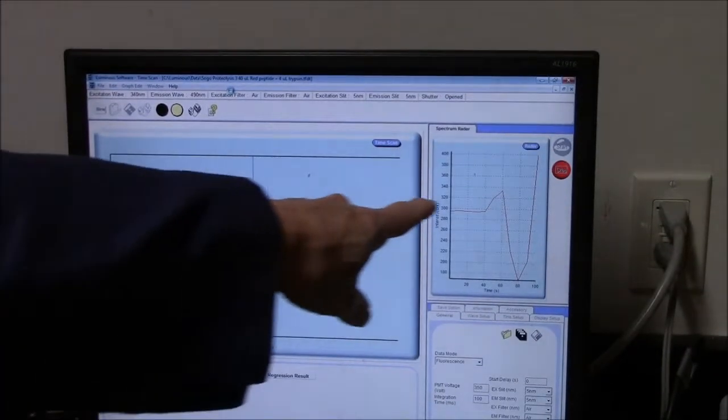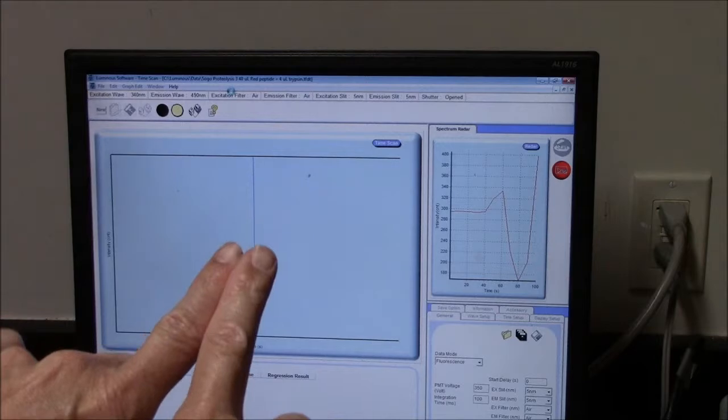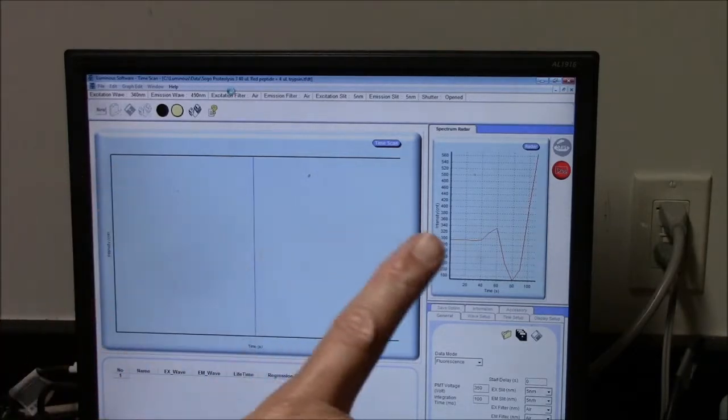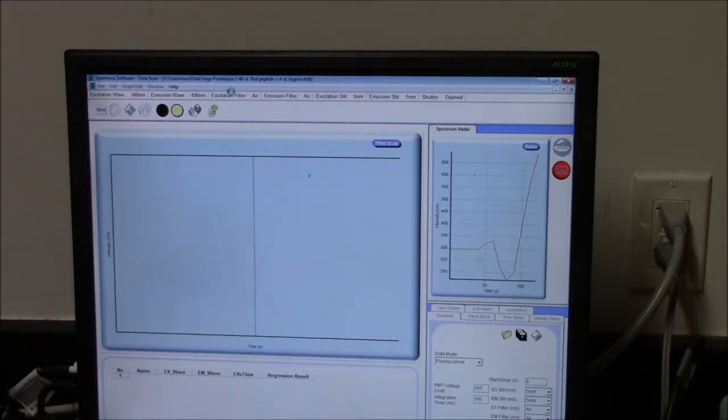So now I'm expecting to see the fluorescence start rising rapidly. As the peptide gets cut into 2 pieces, we're separating the EDANS fluorophore from the Dabcyl quencher. So this is a great way to measure the rate of proteolysis, the rate of trypsin cleaving this peptide. And there we are, off to the races. So we'll come back in a few minutes and see how things look.